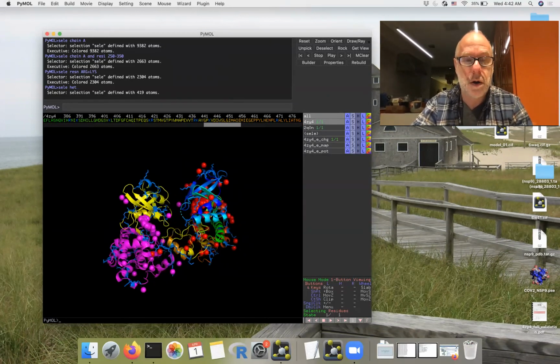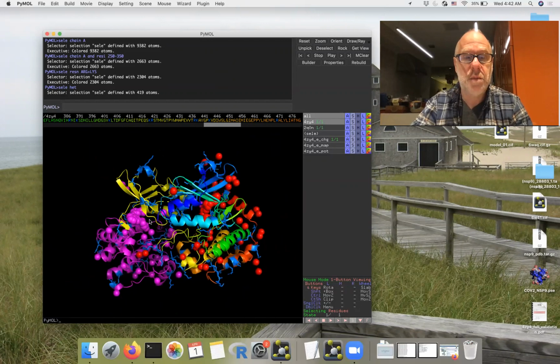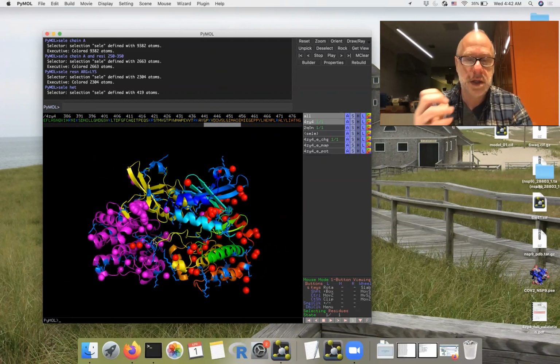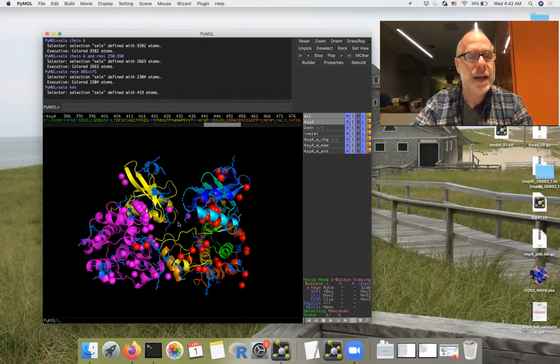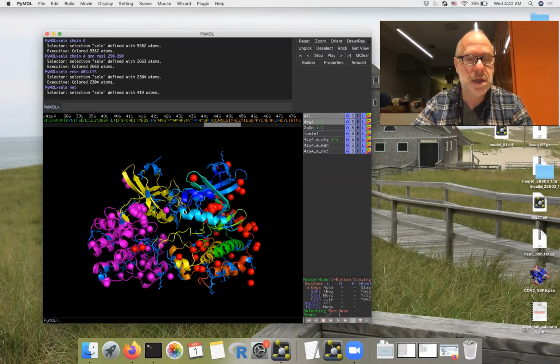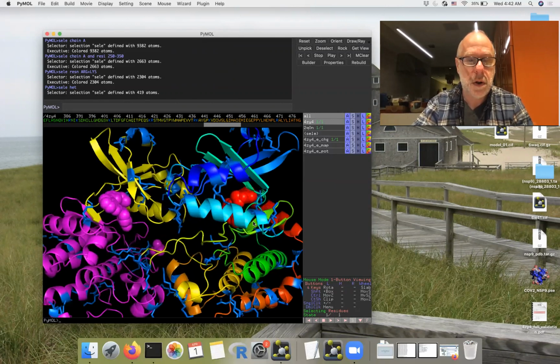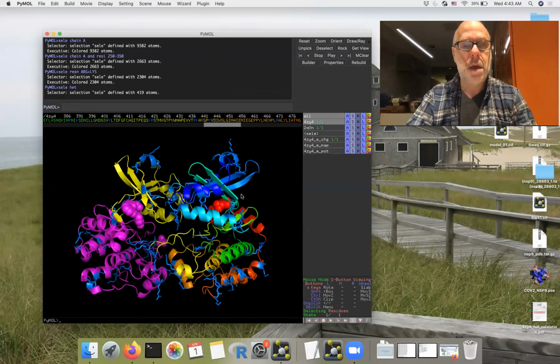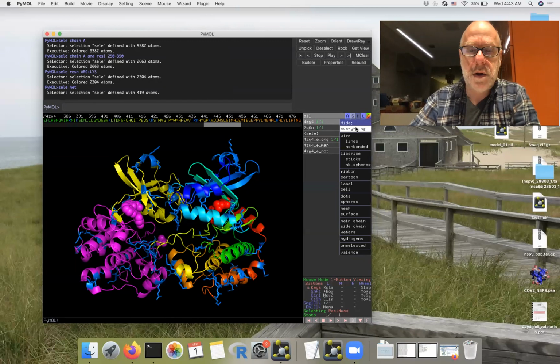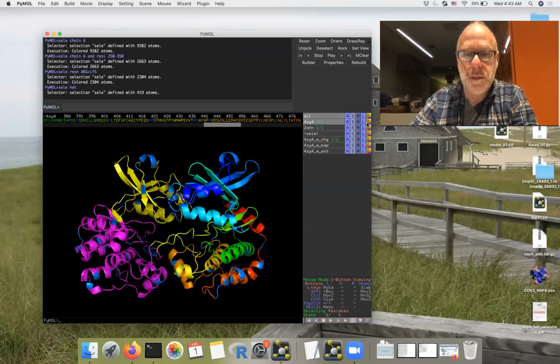The single atoms are water molecules that the authors have modeled because they can see them in the electron density. You can see just an oxygen atom. Typically, I'm not interested in those, although in an active site involved in catalysis, you may want to see them. You can hide those. If you go to the H menu, you can hide all of the waters, and then those will disappear. I'm going to hide all of that and show it in cartoons. Back to that. And I'm going to color it back to chainbows.